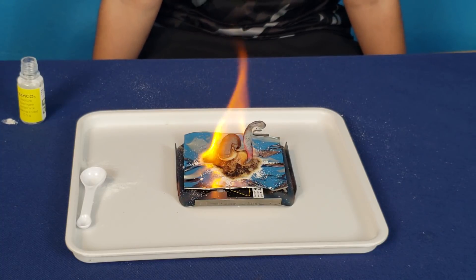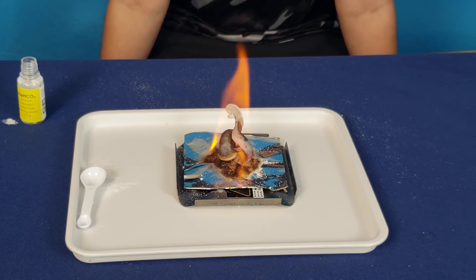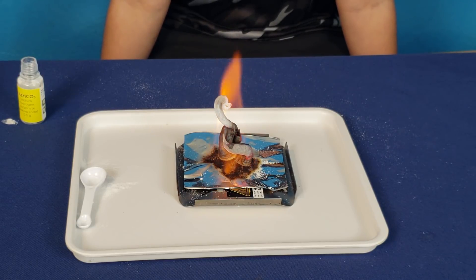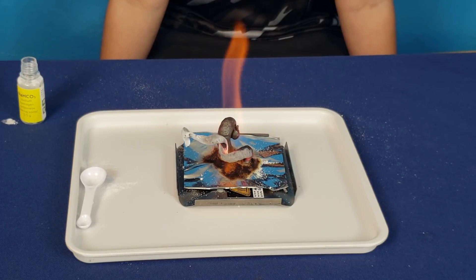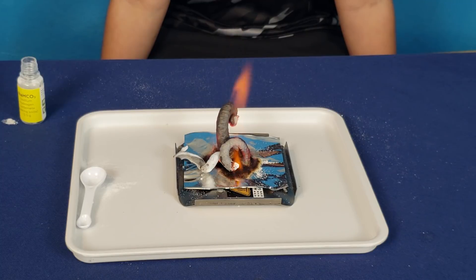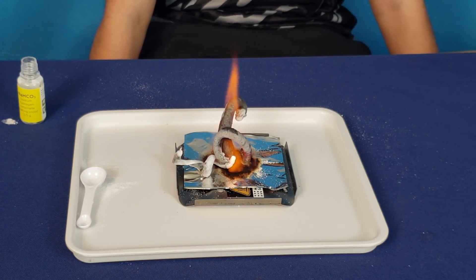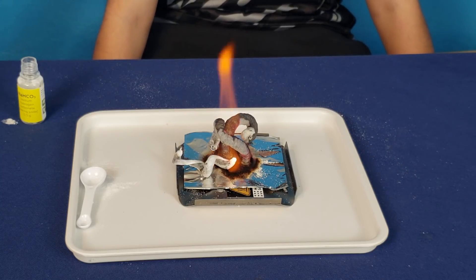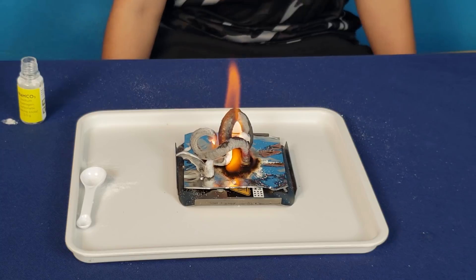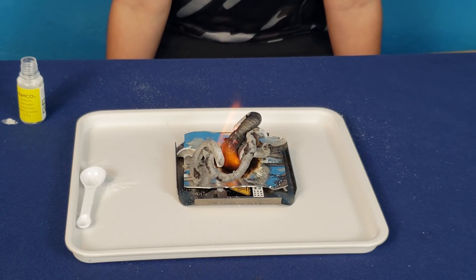It's going huge! I'm never going to stop growing! Wow, that's pretty cool. It's like snakes coming out of the ground. It's like a garden snake — it's like magic snakes coming out of nowhere! This is growing big — yeah, it's way bigger than the last one.